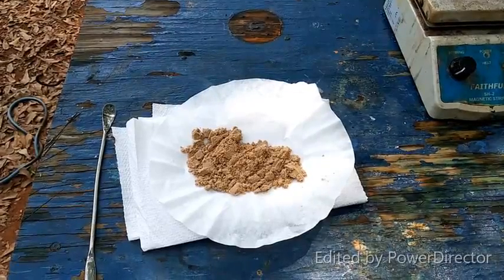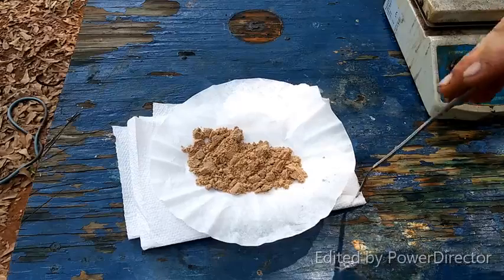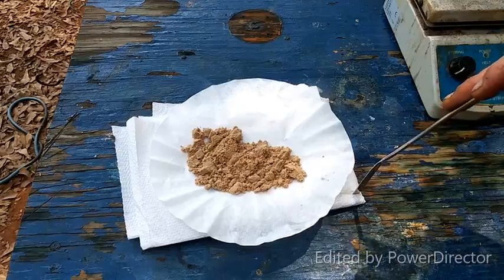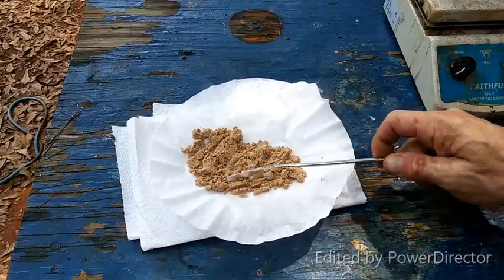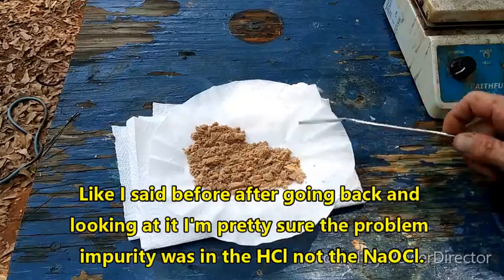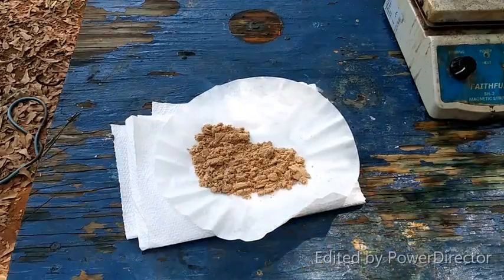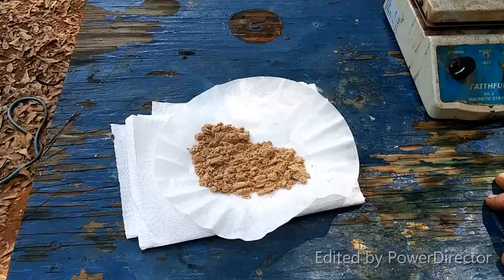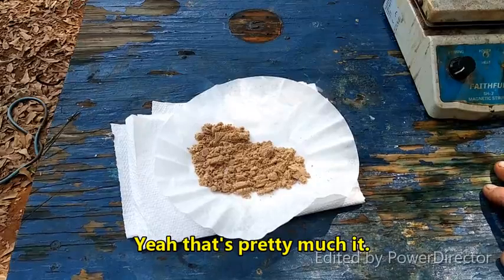Okay, people, so I filtered off the anthranilic acid and I washed it with 100 mils of ice water, and this brown sugar looking stuff is what I've got. It still has to be dried out, but yeah, this kind of looks like crap. Like I said, it has to be the sodium hypochlorite solution that I used, because I feel pretty good about the purity of almost everything else. I mean, the HCl, okay, that's hardware store HCl, so maybe that could be it. I'm not really sure.